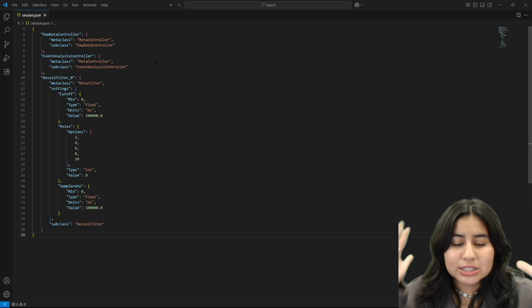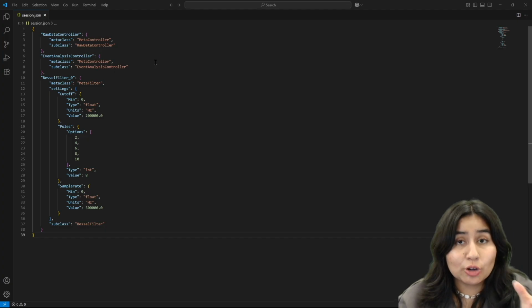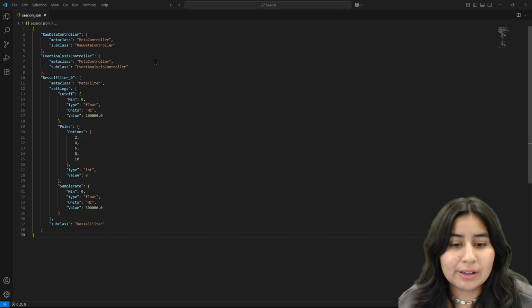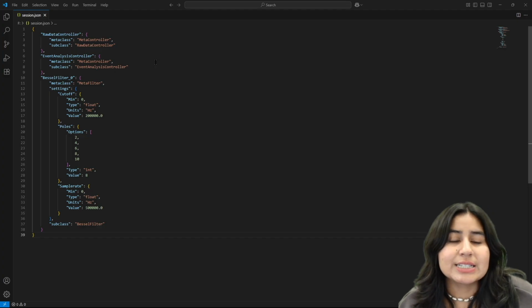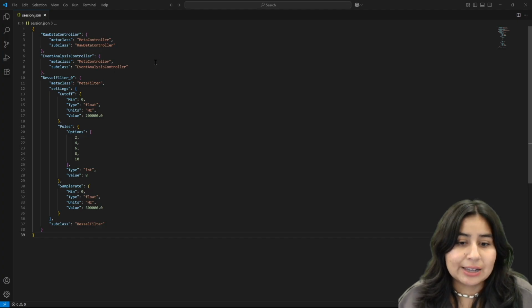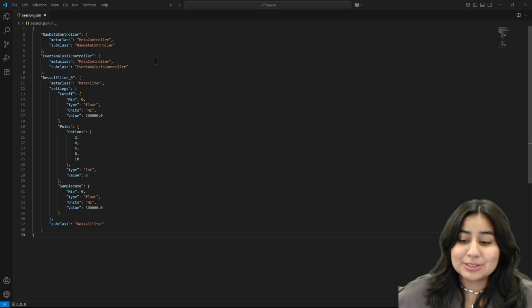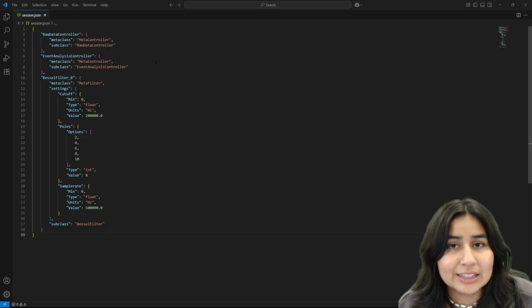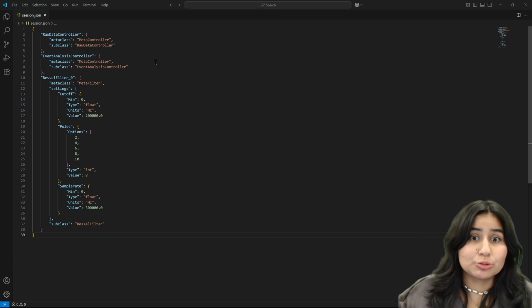So what saving a session does is that it's gonna save your milestones. So the data you loaded, the filter you created. What it won't save is any processing that took place, like the seconds you plotted or like the events you found. You will have the elements to conduct this processing again, but once you load it won't be there. So just something to keep in mind.